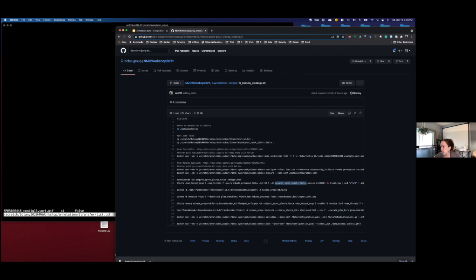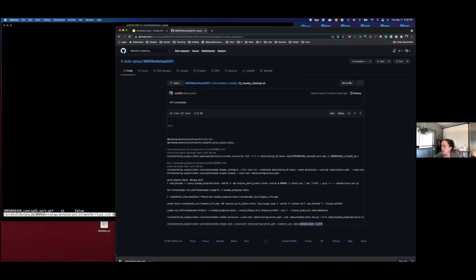Let me see if there's anything else I wanted to say about that. The end file from all of this is Mikado. It actually gives you a few files: Mikado loci.gff3, and Mikado subloci.gff3. This file gives you scores associated with the genes, so that you can try to pick out ones that have a higher score that might be better for use in the training set.